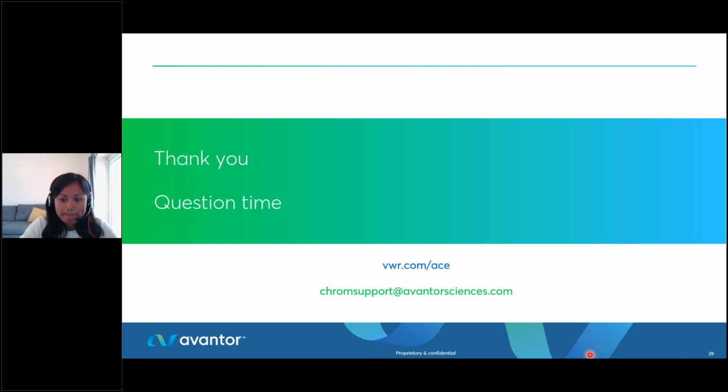So you didn't go into alternatives to acetonitrile, but what options are there? Because obviously that's one of the solvents that are of concern. Yes, I think the one that always pops up straight into my mind is IPA. However, when that pops up in my mind, there's also that game of compromises. So IPA, definitely a different organic strength, and also you're going to have a different viscosity profile. It's actually more viscous than acetonitrile. So make sure you can have that back pressure to play with.